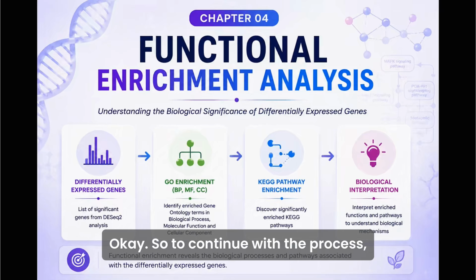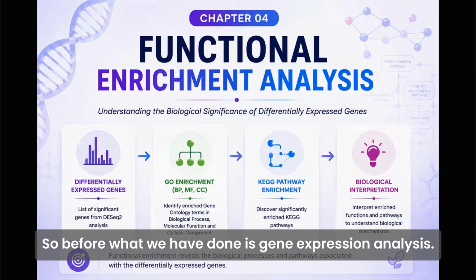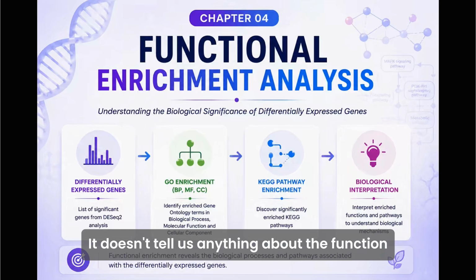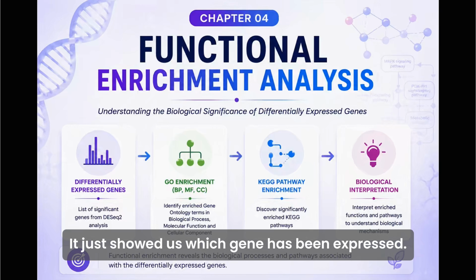To continue with the process, we are now going to do the immediate next step, which is functional enrichment analysis. Before, what we have done is gene expression analysis. It doesn't tell us anything about the function and which pathways have been affected. It just showed us which genes have been expressed. Think of it as a reaction to a stimulus, right?